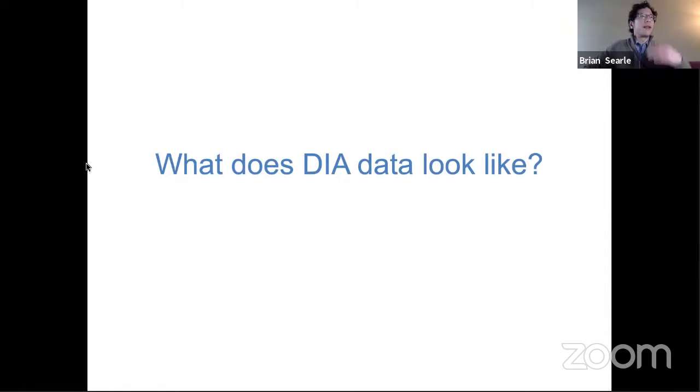And the next question is about overlapping fragment scans. We'll get to that a little bit later, so that will definitely be discussed. As well as how we actually set up the instrument. Those are the types of things that we'll definitely be discussing later, so we'll get to those as we go.